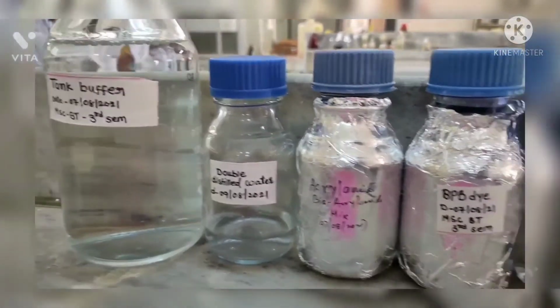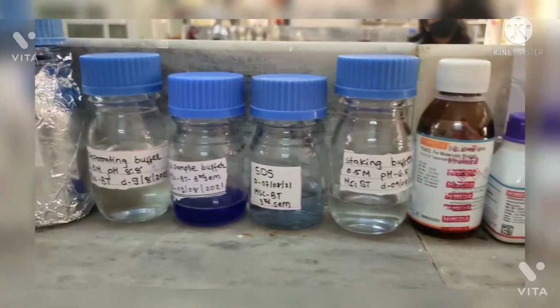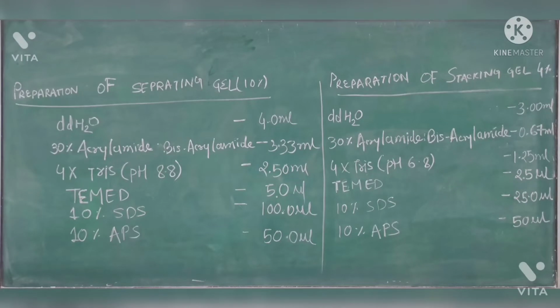Our chemicals are ready. Now we prepare the separating as well as the stacking gel. For making the separating gel, we are making a 10% separating gel here, right? And depending upon your protein, you can decide the percentage, but here we are making a 10% separating gel. So in between the plates, first of all you cast the separating gel, then after that the stacking gel, because the stacking gel is always on the top of the gel.